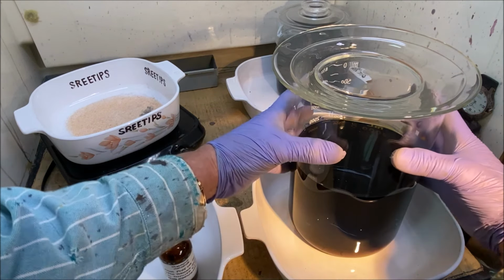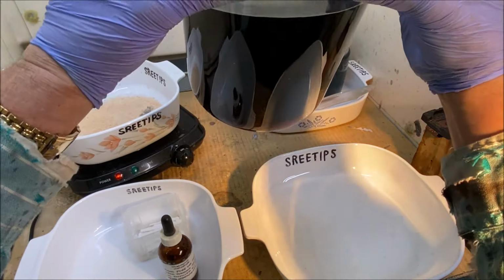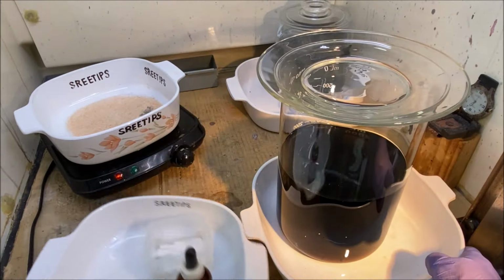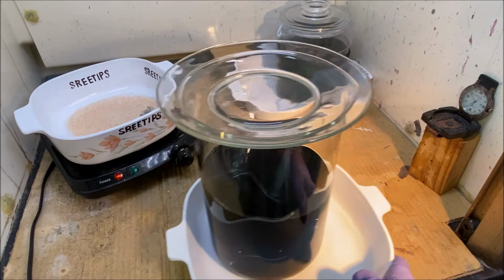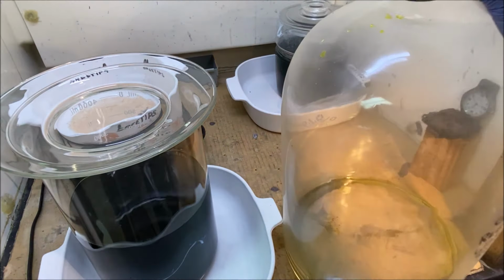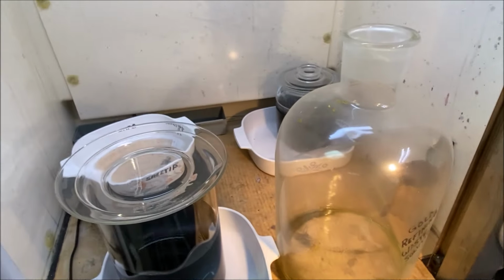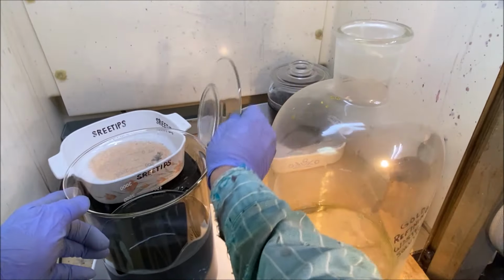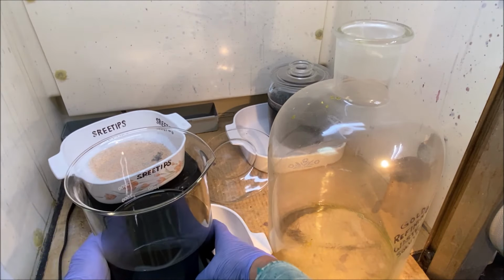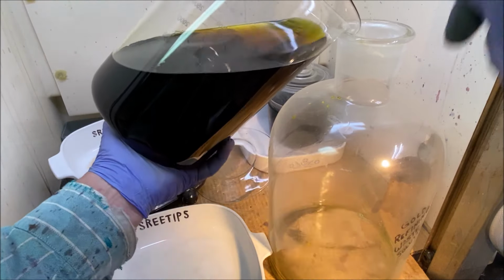Welcome back to part two of this refining series. Here you can see the gold down in this beaker, a goodly amount of it. We're going to begin by removing this waste liquid. We're going to pour it off into a waste container here that I have set up. I normally put this stuff in my stock pot to reclaim any precious metals that might still be in this liquid. We're just going to pour it in this temporary container right now.